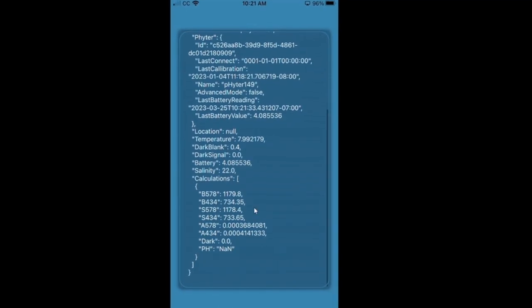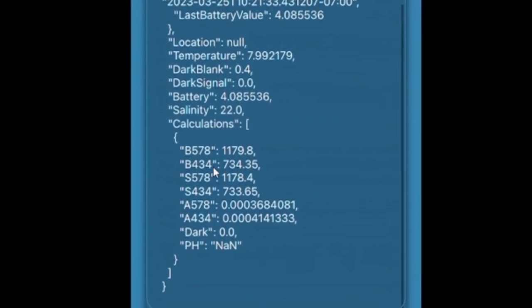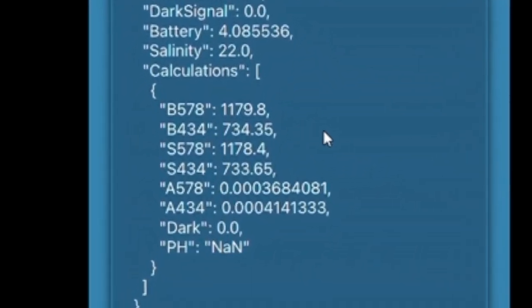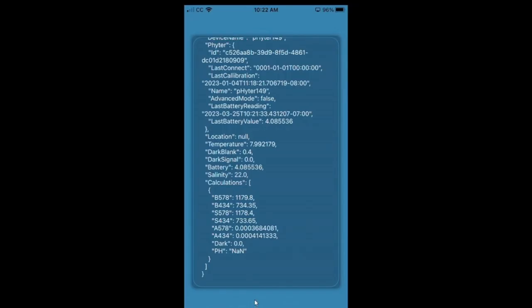In this case, the absorbance readings are too small and this reading is not high enough. So you can either change the settings or start with a fresh sample. Return to the program or press anywhere outside of the box.